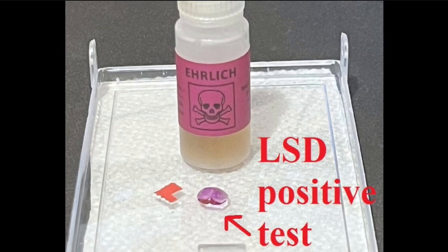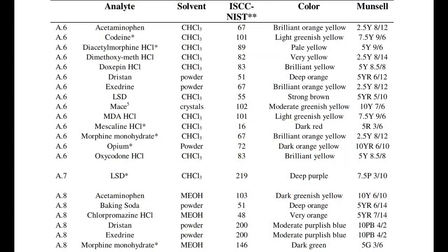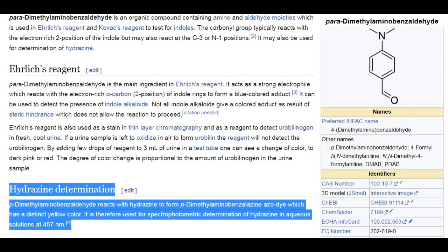This reagent can be used to test for indoles, among other things. In other words, tryptamines, although other indoles may very well give a positive result. Since the indole moiety occurs in myriad compounds that aren't controlled substances, a false positive wouldn't be difficult for a shady dealer to pull off. Just something to keep in mind.